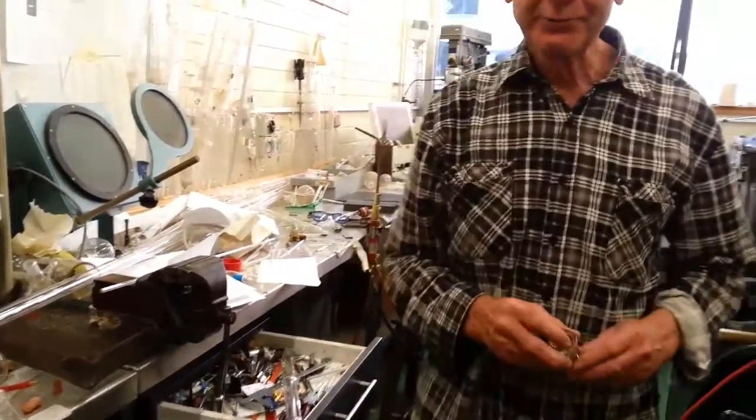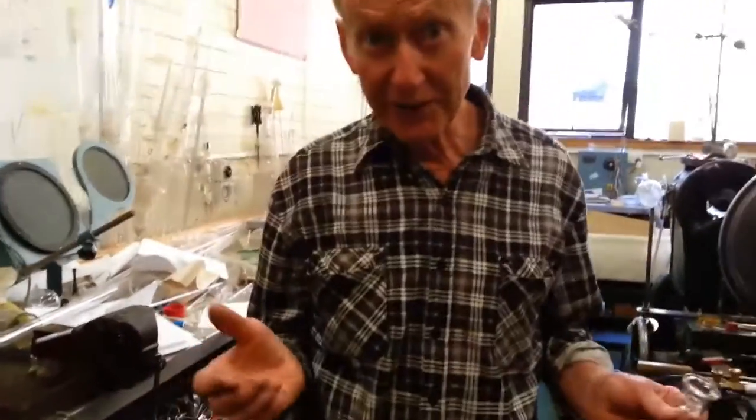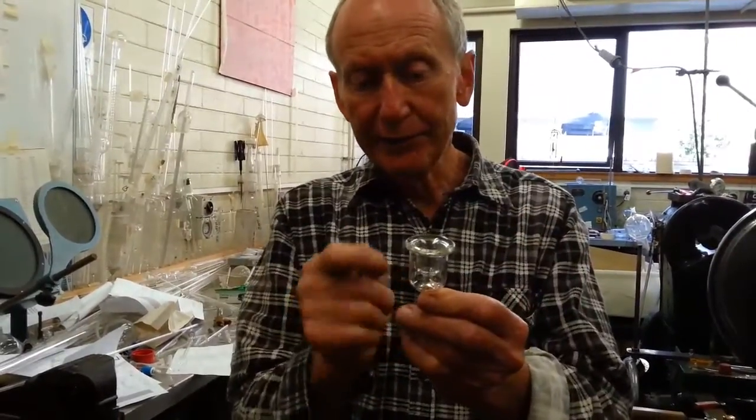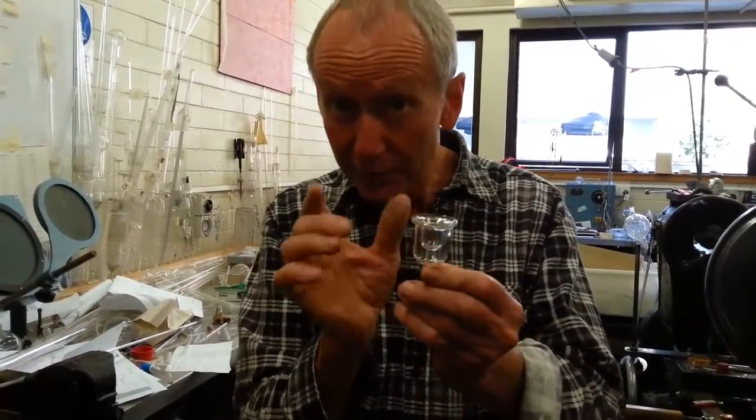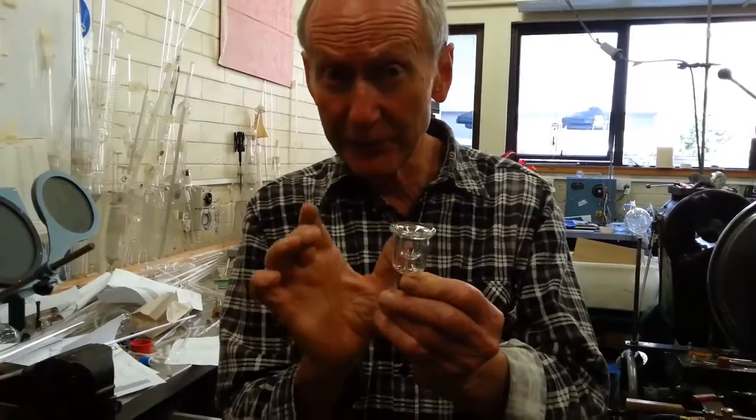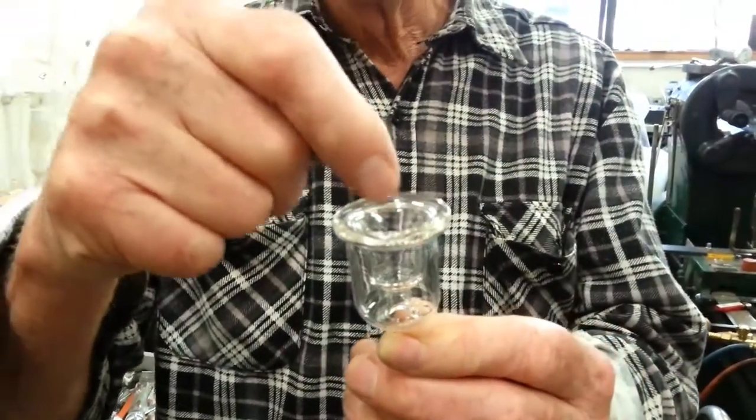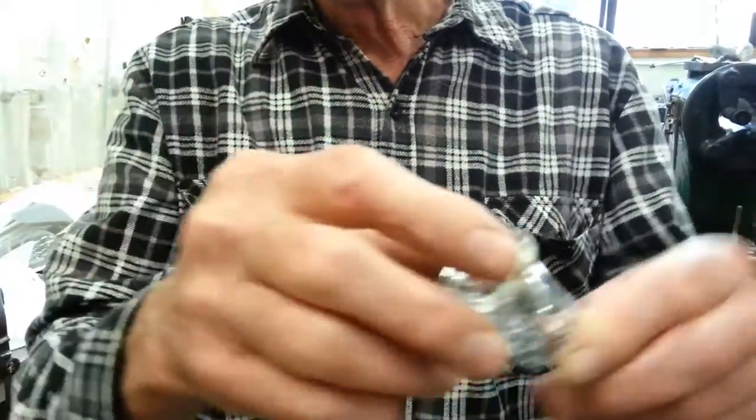A lady wanted to feed mosquitoes for malaria. And so she puts a bit of parafilm over this glassware. And that'll have an inlet and outlet to keep everything at 37 degrees, as the mosquito likes. And the mosquitoes will come and feed on the parafilm here. Actually, it's inverted like that.